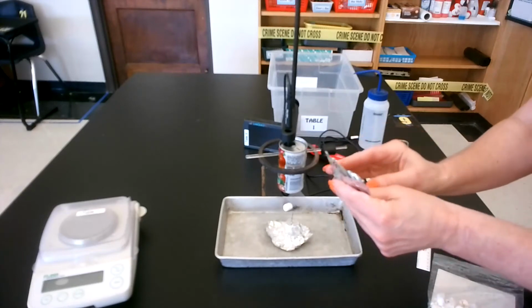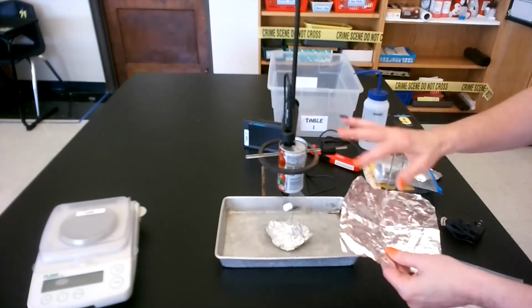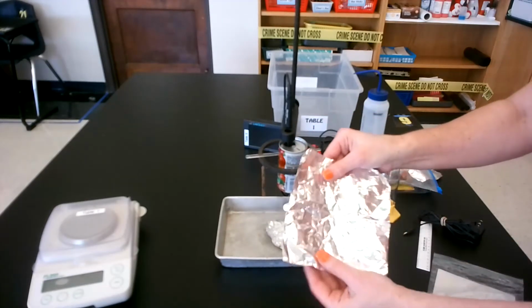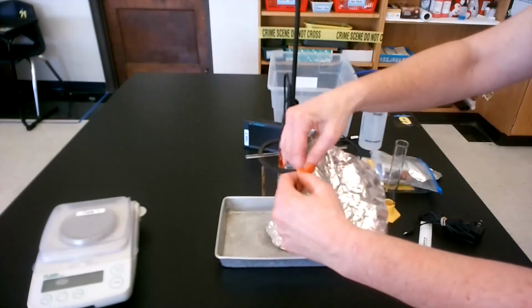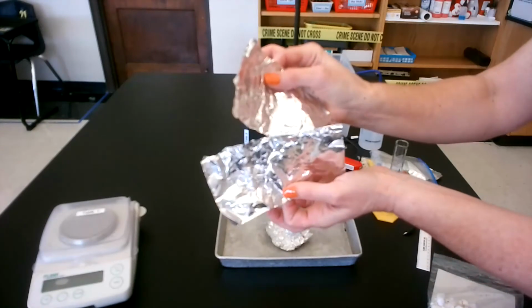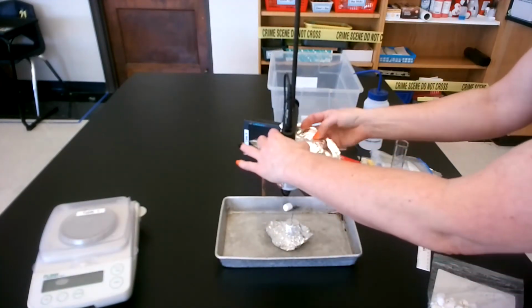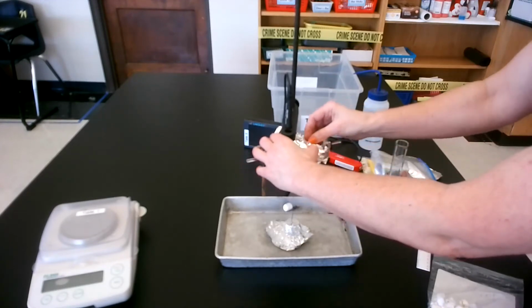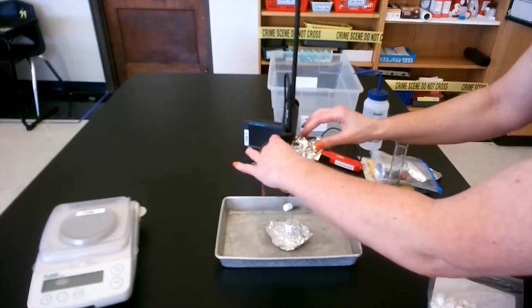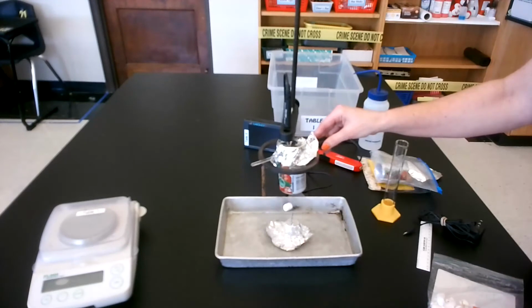Then I have my second piece of foil, and I'm going to try to cover up these holes the best I can to keep all that heat in. So to do that, I'm going to take my piece of foil and tear it in the middle so that it makes a slit to the center. And then I'm going to go around and overlap it on the back, tuck everything in. Okay, this is after I've already got my thermometer at the right depth, covering up all these holes.